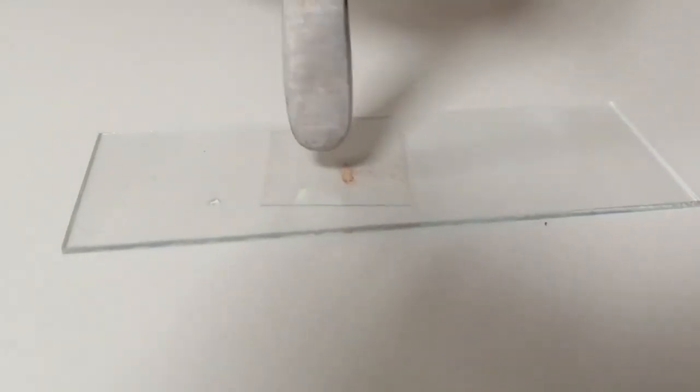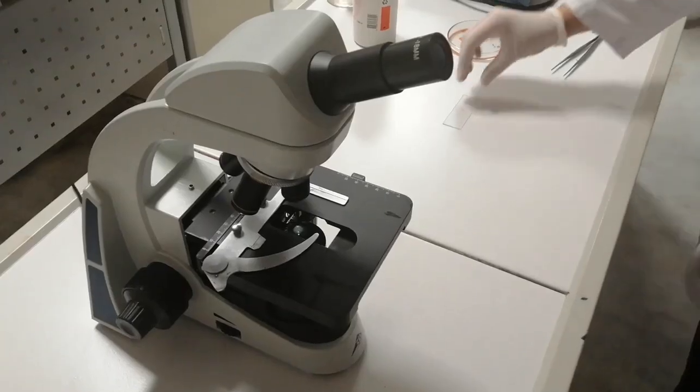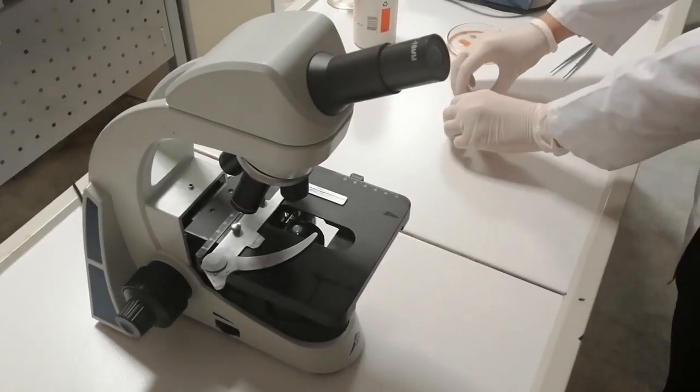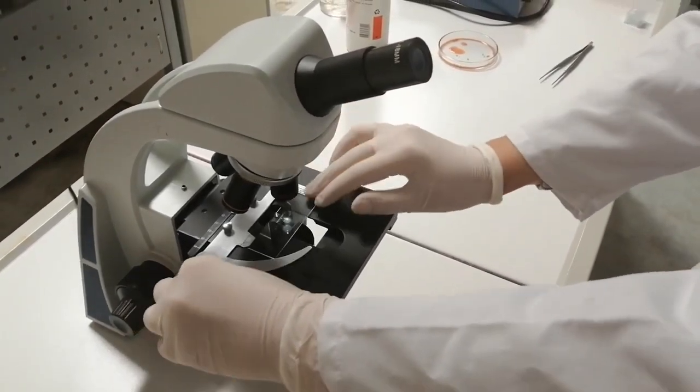Coming up next, pressing the coverslip gently with forceps in order to squash the root tip. The root tip should spread out to a diameter about half to one centimeter.